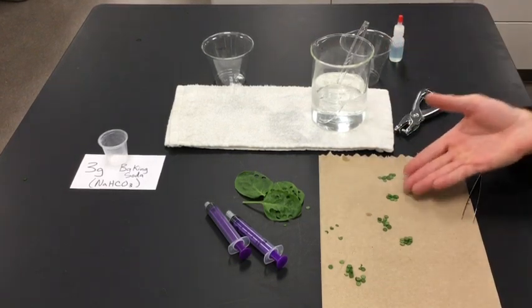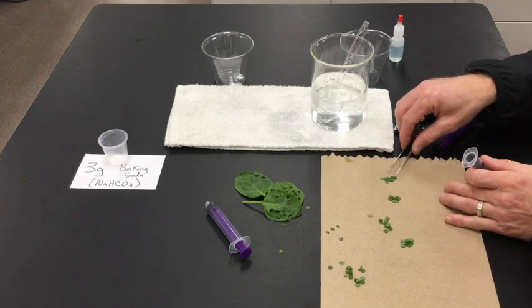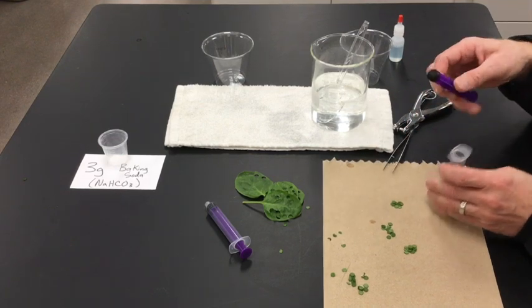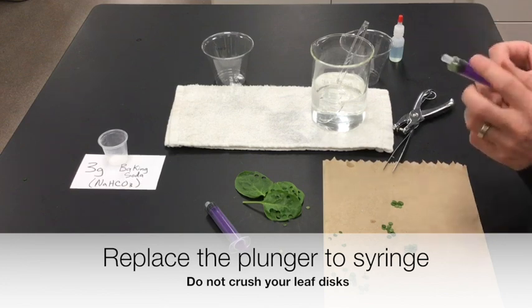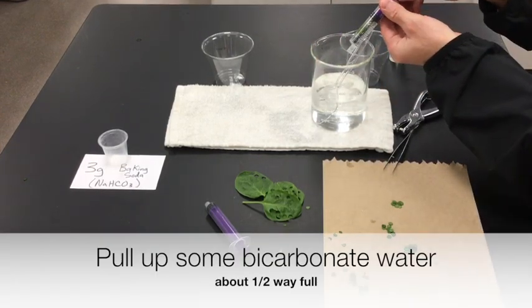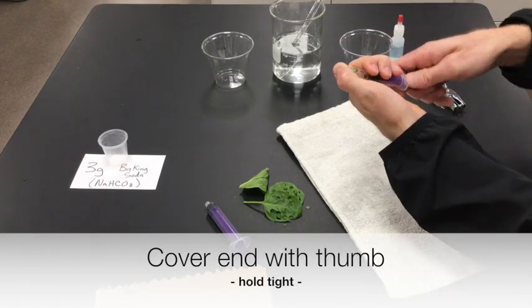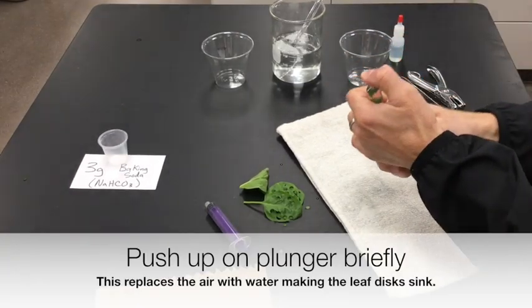Once your bicarbonate water and leaf discs are ready, take a syringe, remove the plunger, and load a pile of 10 discs into the syringe. Put the plunger back in — don't crush them, just push it down most of the way. Pull up some of your bicarbonate water, filling it about halfway. Then put your thumb on the end, pull back on the plunger, and shake to remove the air from inside, then push up.